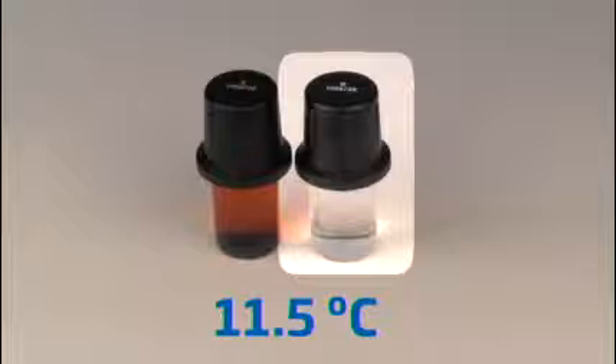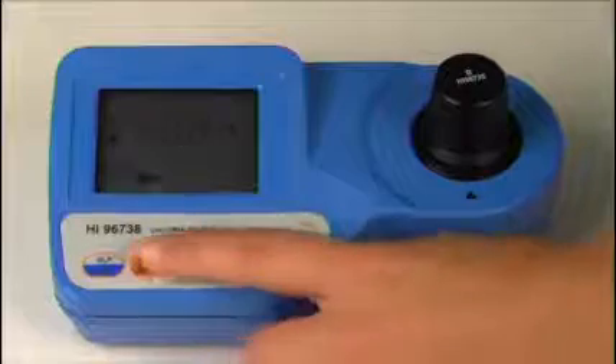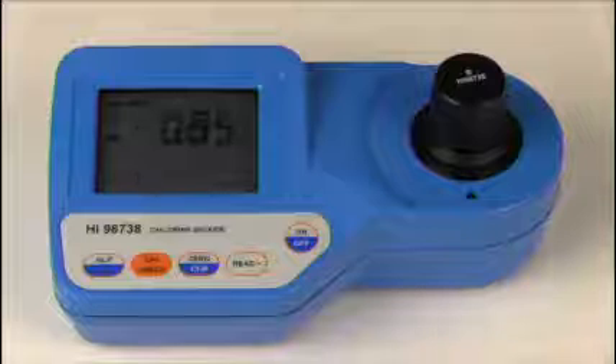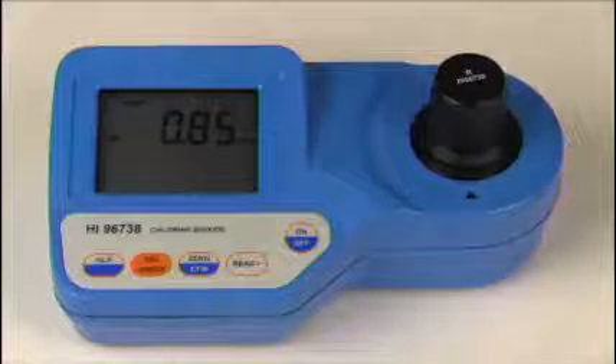Next we are going to read the one milligram per liter standard which has been cooled to 11.5 degrees Celsius. We will zero the meter, wipe the standard of any dust or prints, place the cuvette into the meter and index it, then press the CalCheck button. The cooled standard reads 0.85 milligrams per liter, which is significantly lower than the expected value of one milligram per liter.